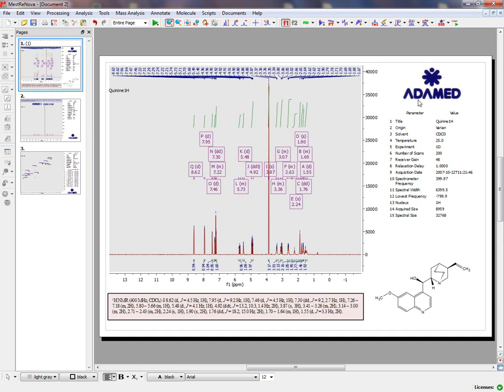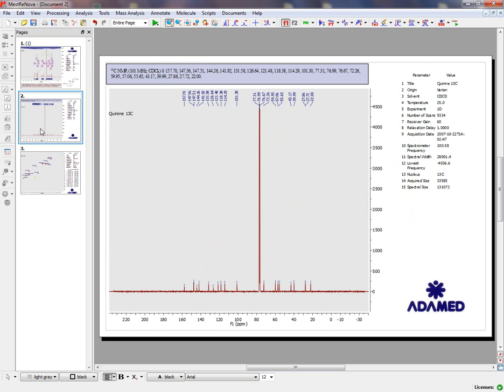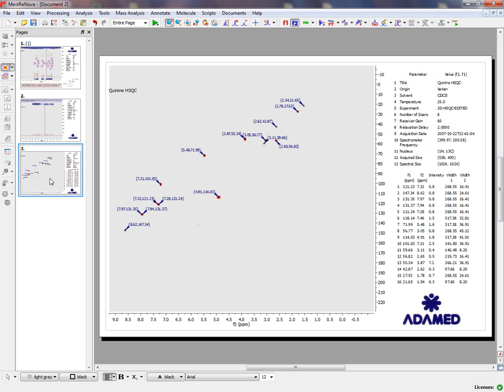peak picking, the logo of your company, the parameters table, and the molecular structure. Similar with the Carbon NMR Spectrum and the same with HSQC.